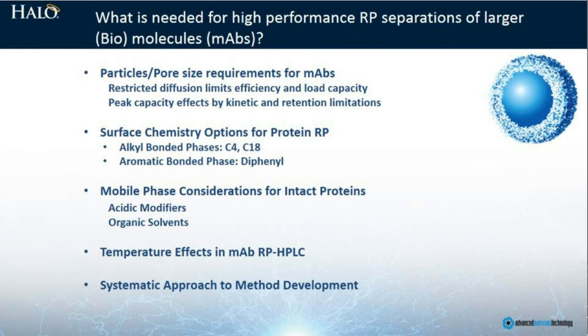With such particles now available and demonstrating utility, we have endeavored during the last decade to look at some of the other considerations for generating high-efficiency protein separations, and in particular, the modifiers and conditions for gradient elution. That is, most reverse phase separations for proteins are going to be conducted under acidic conditions.